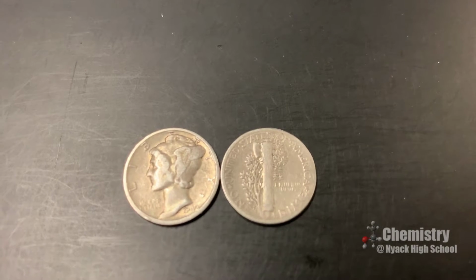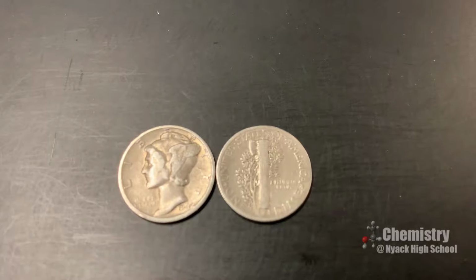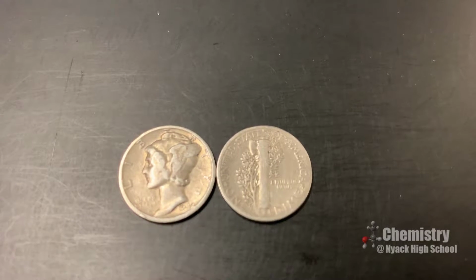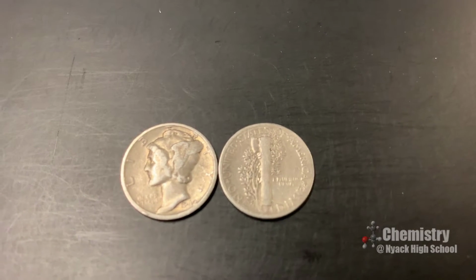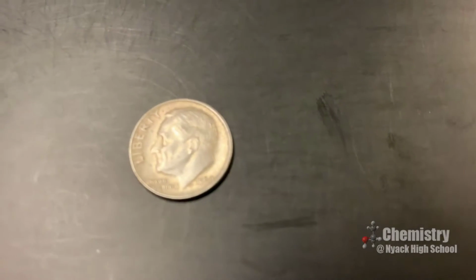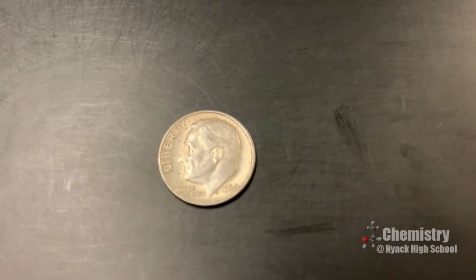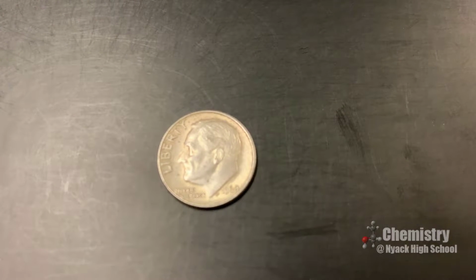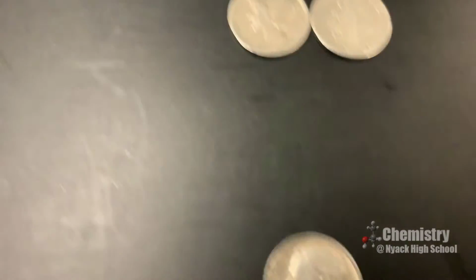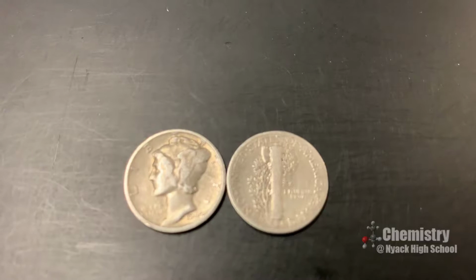So-called mercury dimes were minted between the years 1916 and 1945, and they contain silver, which is probably why you rarely see them in circulation. Roosevelt dimes also contain silver, although only the ones that were minted before 1965. We're going to determine the amount of silver in a mercury dime through a gravimetric analysis.